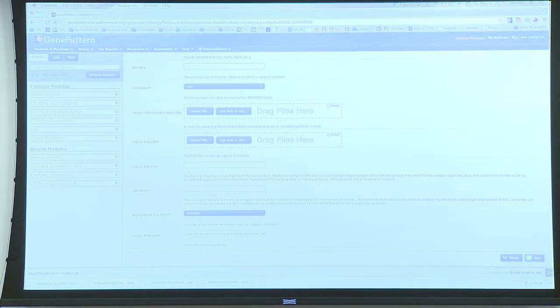So in our case, it's always going to be chromosome 19. Start can be anywhere on the chromosome, and then end can be anywhere. By the end of the day, it just tells the script or the code where to go and where we measure these reads, or where we take the bins from and measure them and normalize. And this is our first script.